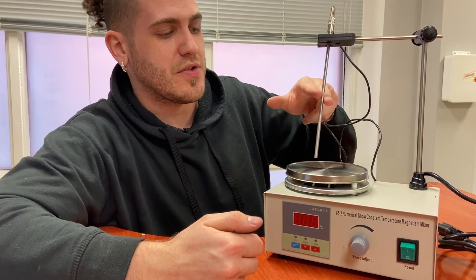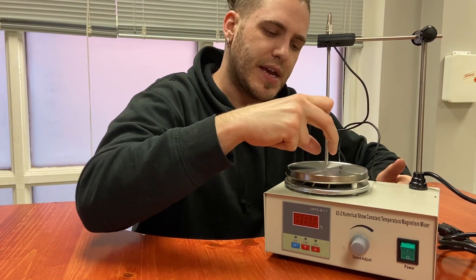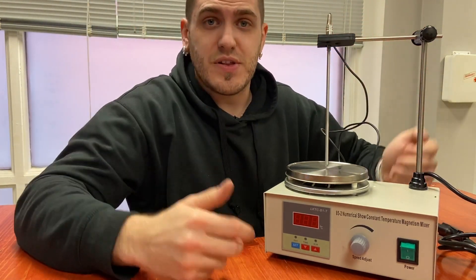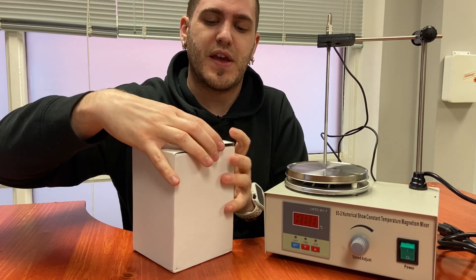This is the magnetic stirrer. There's a little plastic pellet that sits inside the beaker and stirs what you're working on — it gives you agitation. It holds very easily a 1,000-mil beaker. Let's just open that up and we can test this all up for scale.